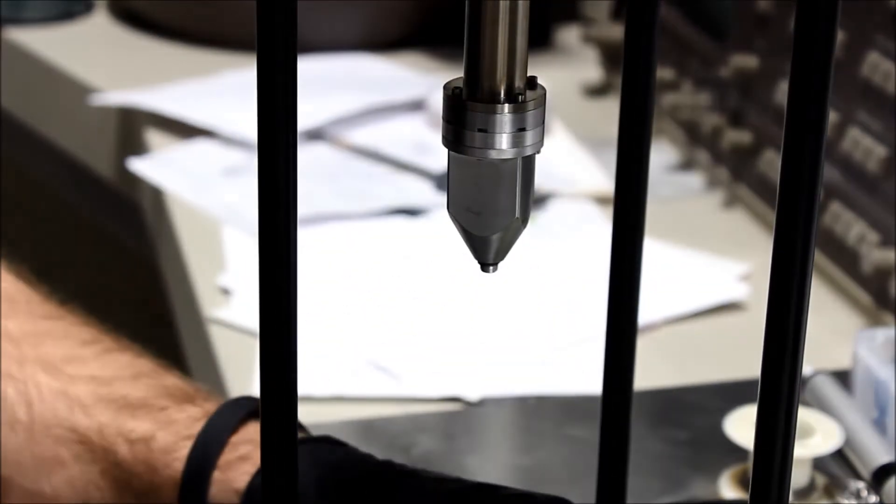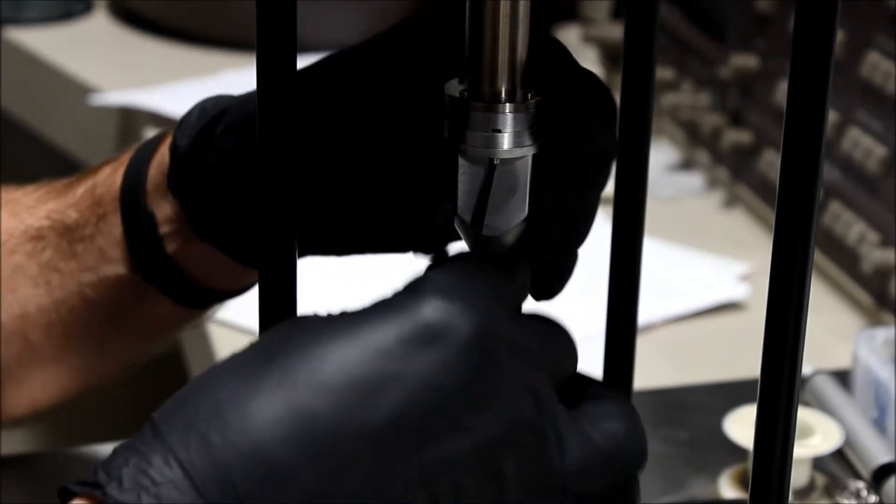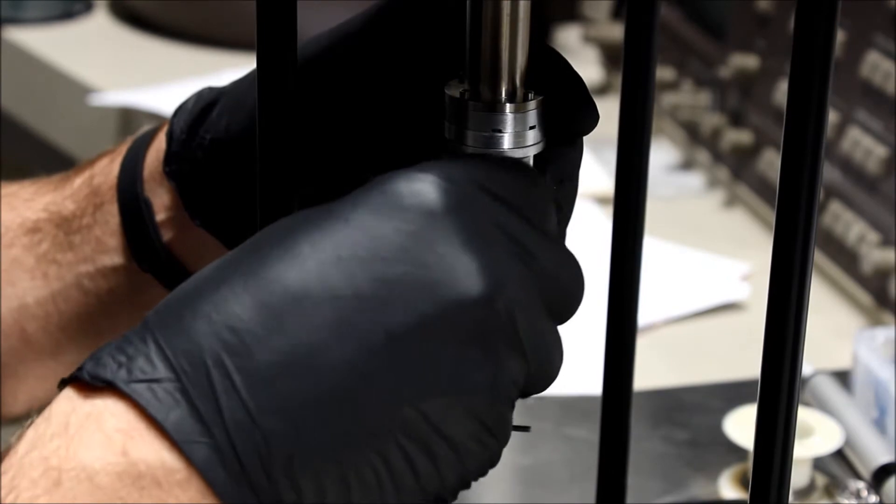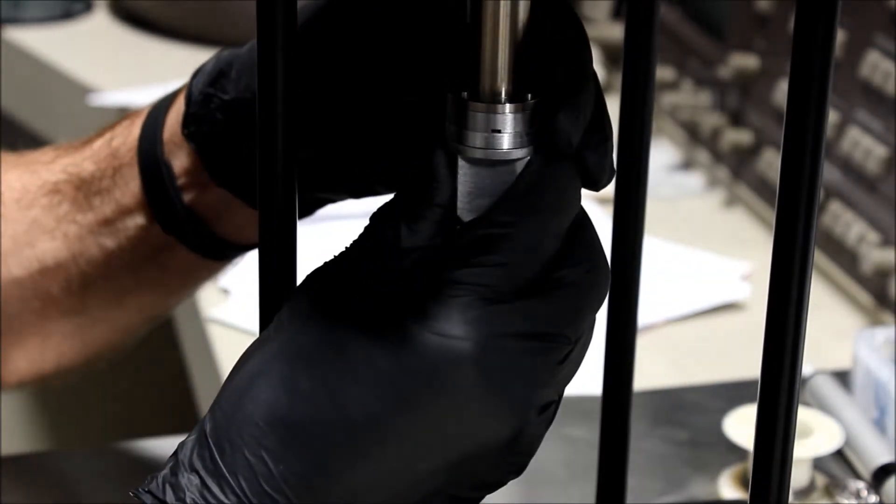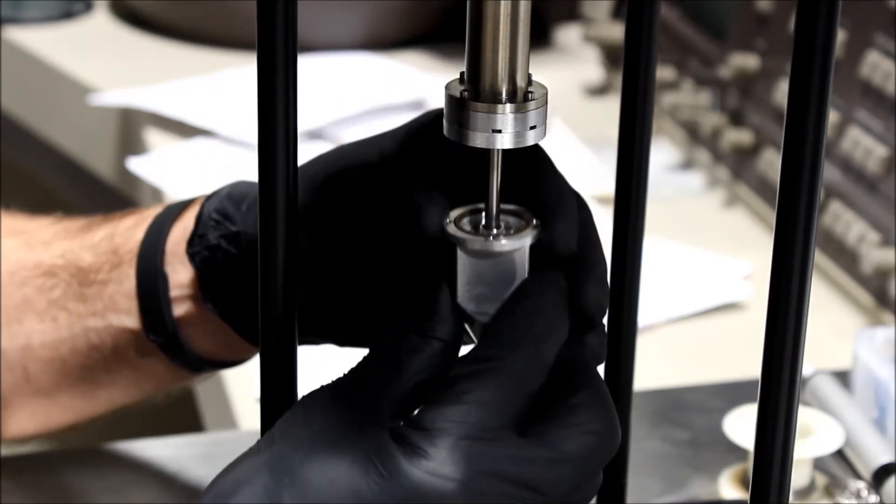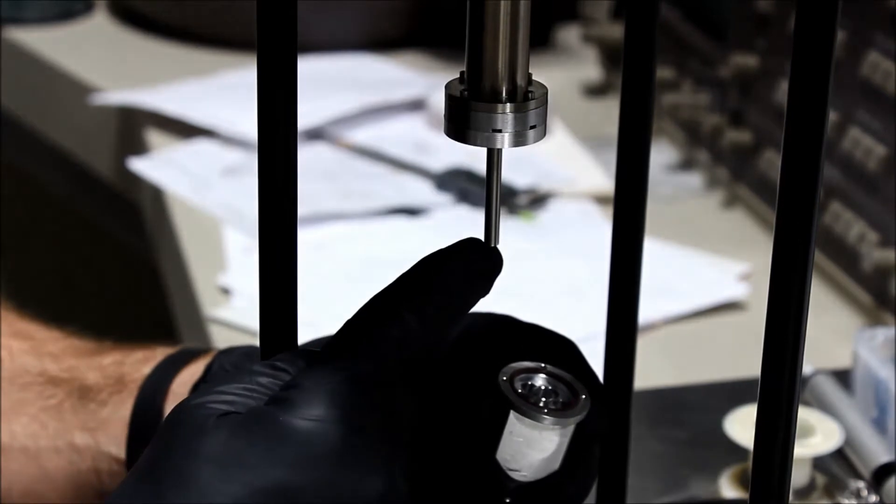When we have all four screws removed, the crucible will easily remove itself from the GIS. Sometimes it requires a little bit of force to get it to pop off, but anyway, this one's coming off nice and easy.